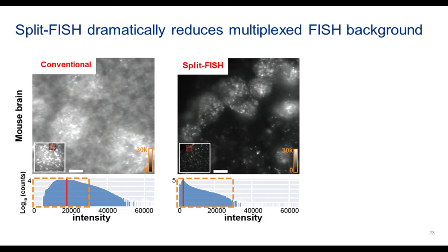So with this, actually, we were really surprised that the background is really drastically reduced in multiplex FISH. In fact, when we first saw it, we thought we must have mixed up the sample, that we're not actually staining a library. But the image indeed comes from this pool of oligos.